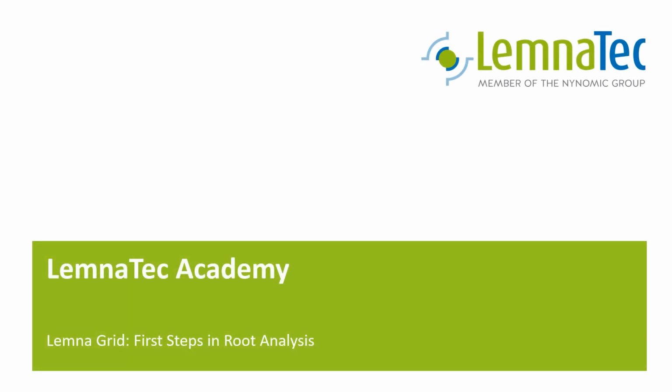In the first video, I will talk a little about segmentation and about some basic root analysis. The second video is about a single LemnaGrid device called the skeleton interpreter. This device is essential for more advanced root analysis. The third video will present a few more special analyses you can do with roots. In the final video, I will talk about a few special points required for integrating these analyses into Lemna experiment.